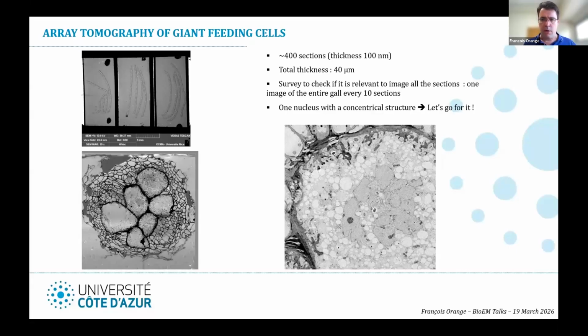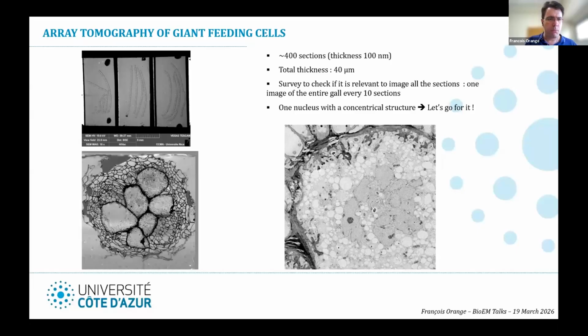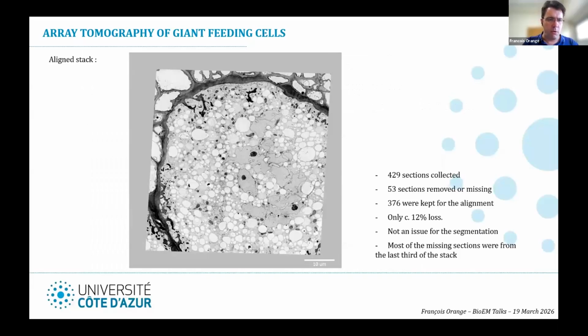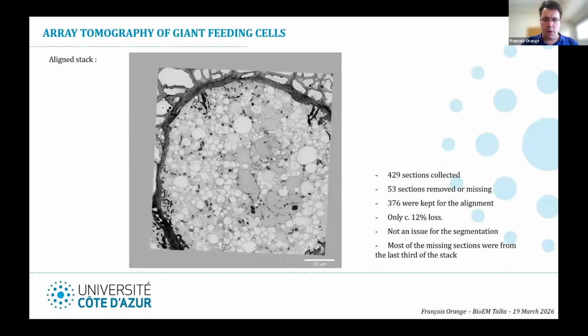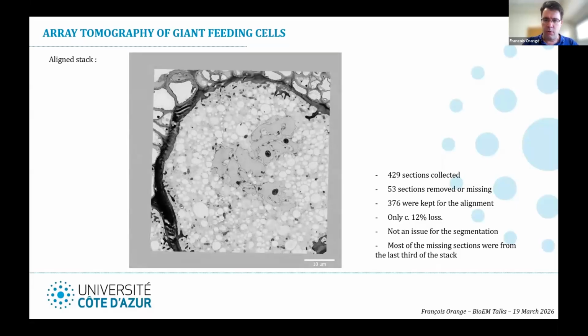So when I saw that, I was like, okay, let's go for this. Let's go for the entire imaging of the 400 sections. Sometime later, I was able to produce a stack of images and an aligned stack. That's what you're seeing here. It's aligned with the IMOD software.